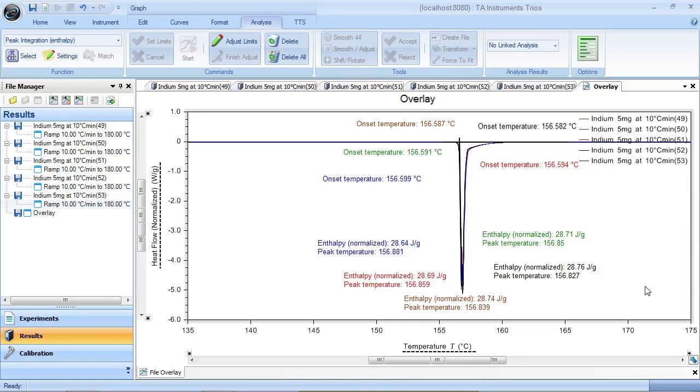But at this point, these results are just labels on a graph. To get these results into a more useful format for further analysis, we have created Analysis Reports, a new feature in Trios that makes it easy and effective to analyze results.